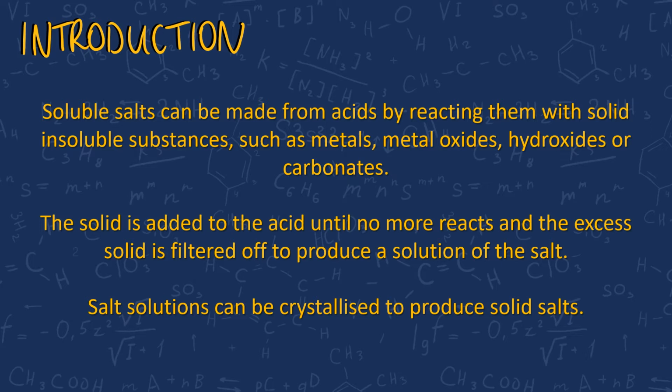So when we mix them together, we've got an acid and we've got a solid, we put in an excess of solid so that we know everything is reacted, and then we don't want that excess solid in there anymore when we produce our crystals, so we filter it off. And then at the end, when we want to produce our crystals, we evaporate it. So we leave it to evaporate and then it will produce crystals.